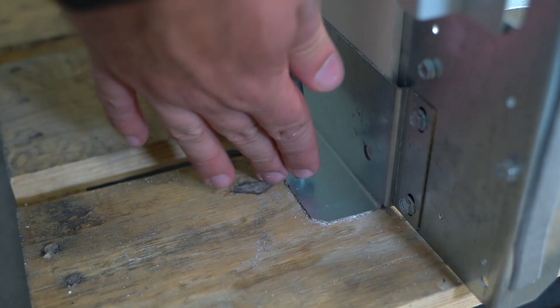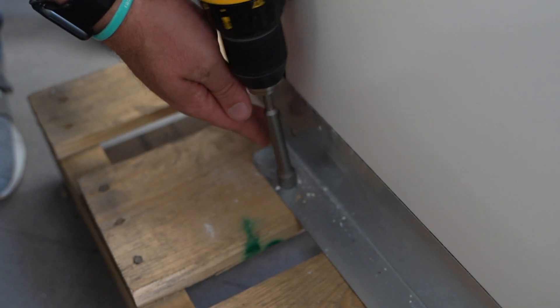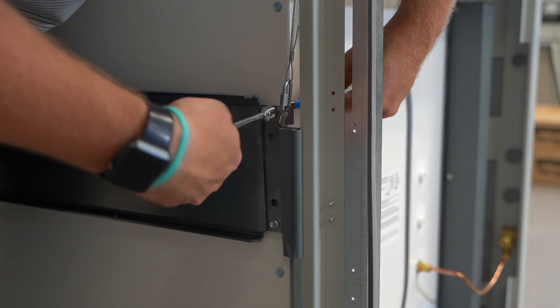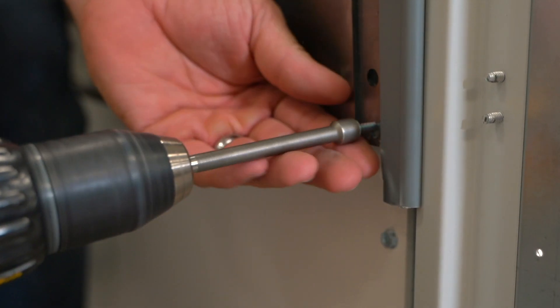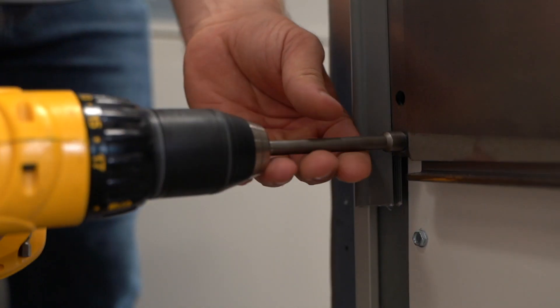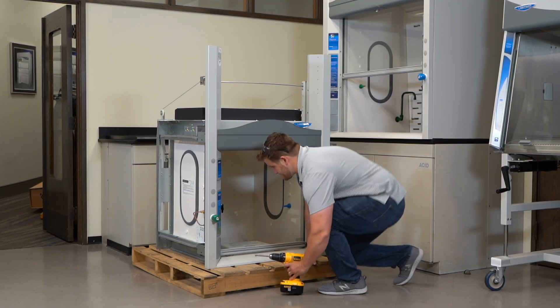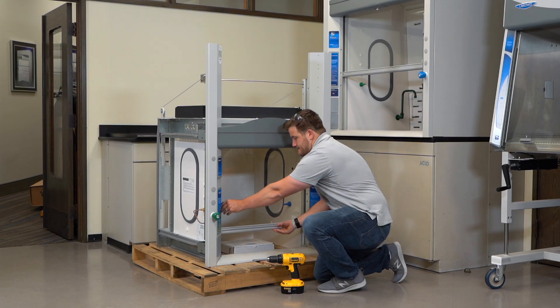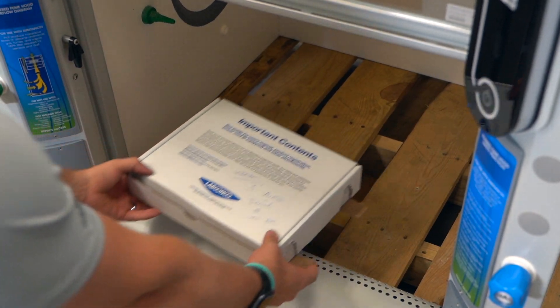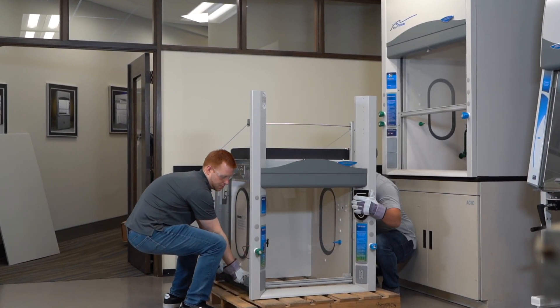Remove all four restraint screws from the sash weights located in the rear of the hood. Locate the installation components inside the hood on the pallet, then free the hood from the pallet.